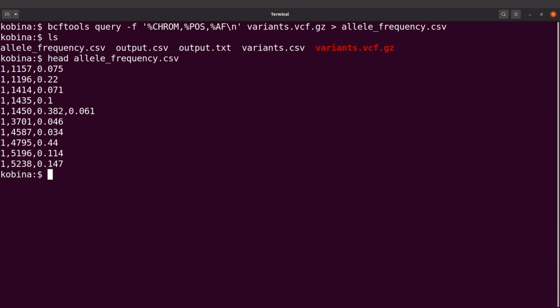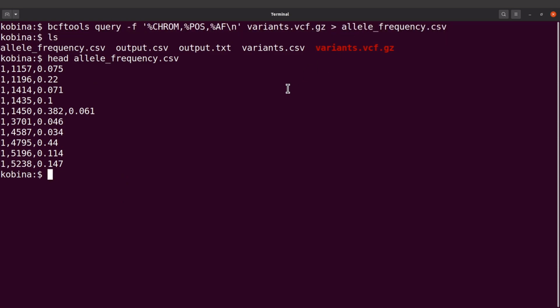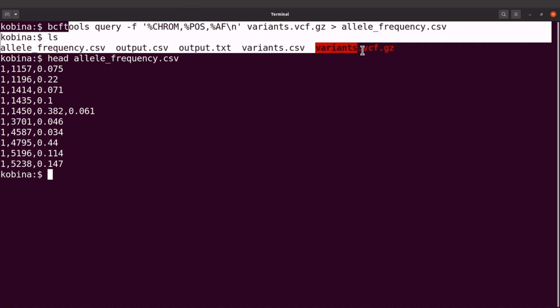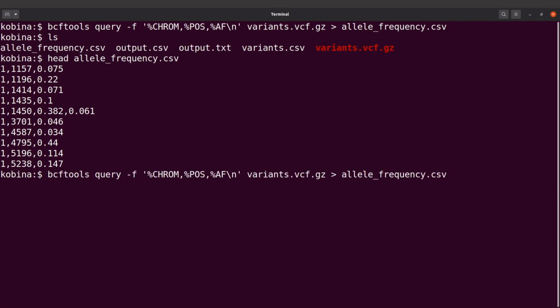So we are going to reissue the same command and we are going to add a header. So this time, instead of first adding the header to the file and then also executing this command, we are going to do everything on one line. We are going to do everything using a one-liner command. So this is how it's going to be. We will have this command first, and then we will issue our pipe character and we say sed. We bring a quote, we say 1i.